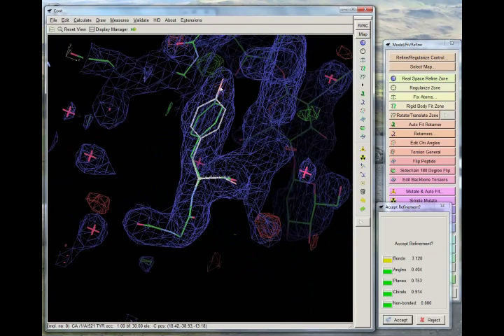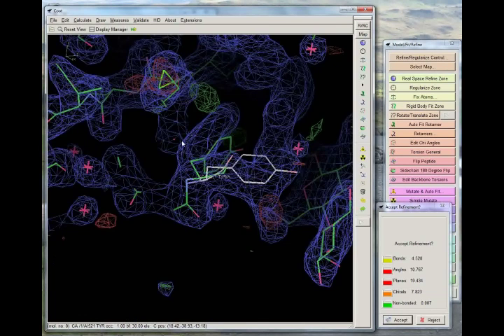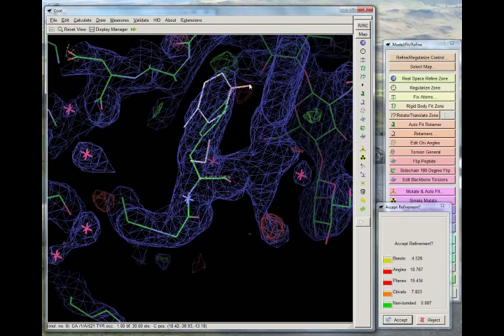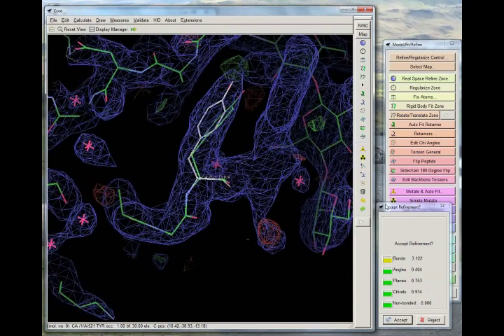And what I accidentally just showed you there, that actually if it doesn't do this well, you can, in this state, if you left click an atom and you drag it, you can actually move it into a new bit of density like that. Now clearly that's not where this wants to go, but in a situation where you may have more trouble fitting something, that's the way to do it. So that's quite cool, that's the fun bit.